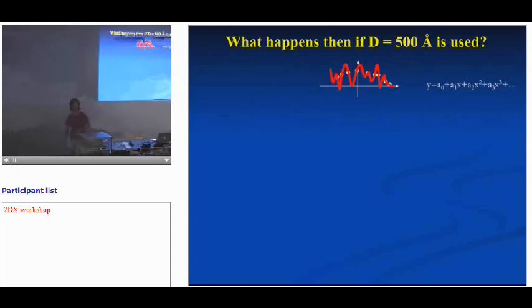Yeah. One of the arguments people made a while ago is that you should use the imaginary lattice in the z direction to be 2 times the thickness that you think your object is. The argument is that the Patterson function is twice the thickness of your object because your effect is going in both directions. Mm-hmm. So if you're fitting electron diffraction patterns without image phases, so only diffraction intensity, you need to sample and double that spacing. And obviously your gap junction is, I don't know, 2 times 60, so that's about double.